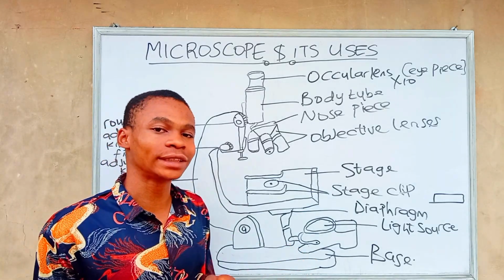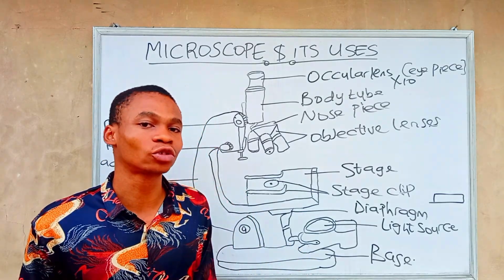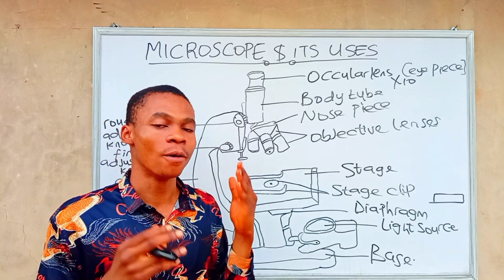Now we'll be discussing how to use a microscope and the care for a microscope.